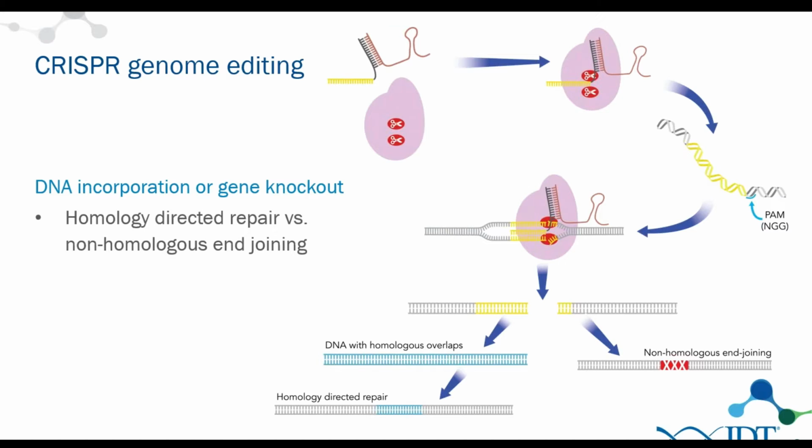So basically, CRISPR-Cas9 is a programmable restriction enzyme, or programmable nuclease, which is composed of a protein nuclease called Cas9, which comes from bacterial origin, and which is driven by RNA molecules. Now, in a natural system this is 2 RNA molecules, and those have been engineered so that they can also be used as one single guide RNA. We'll come back to that in one of the next slides.